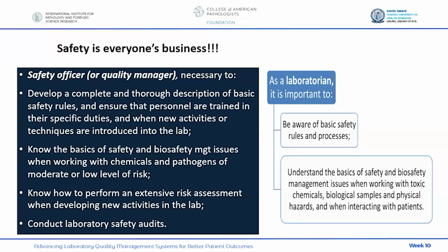And also to conduct laboratory safety audits regularly. So those are what we are expected of the safety officer. On the other hand, for every other staff working in the lab, it is important that everyone knows basic safety rules and processes. And apart from being aware, you need to understand the basics of the safety and biosafety management issues whenever you're working with toxic chemicals, biological samples, physical hazards, and even when you're interacting with patients.